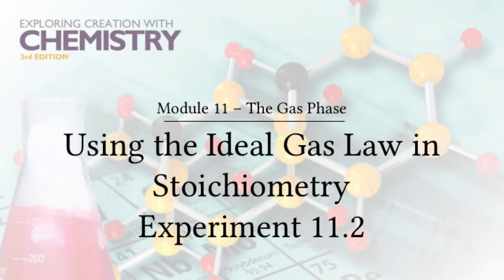Module 11, the gas phase, using the ideal gas law in stoichiometry. Experiment 11.2.